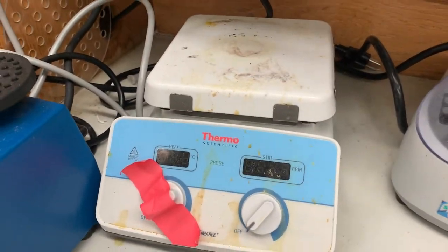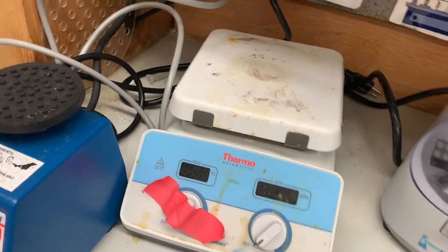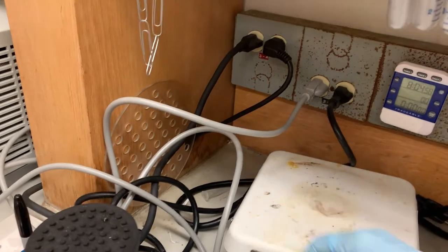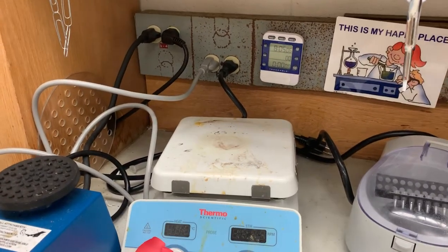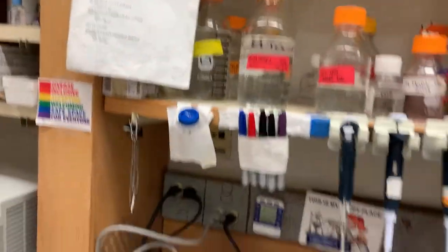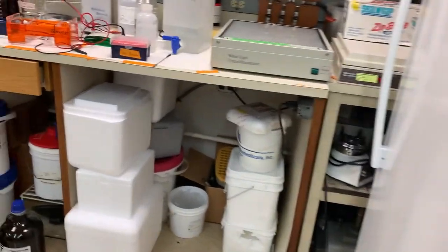Another thing that can get hot is this heat plate, which I don't really use for the heat — that's why I have it taped closed so I don't accidentally press the heat knob, and I leave it turned off. But the stir function uses a magnetic element inside, and you put a magnetic stir bar in your flask and adjust the stirring speed. If you turn it on and nothing's stirring, you probably forgot to put in the stir bar — that happens all the time. Also on my bench you'll see lots of buffers, which are pH-stabilized salt water, and stock solutions of various salts at higher concentrations that can be diluted.